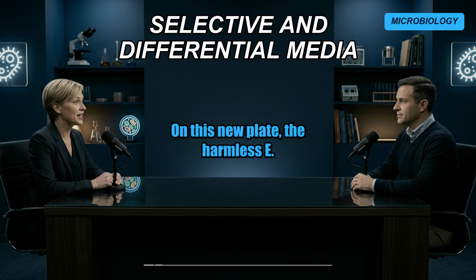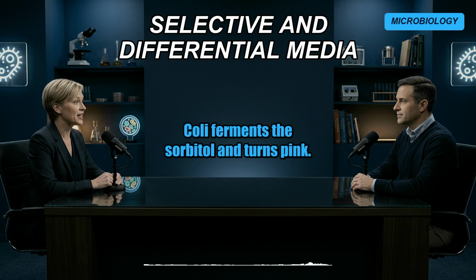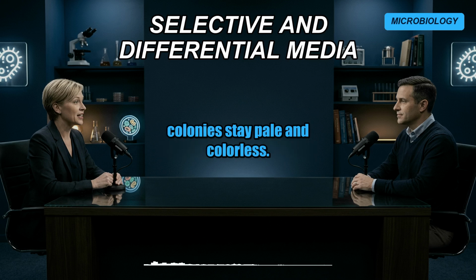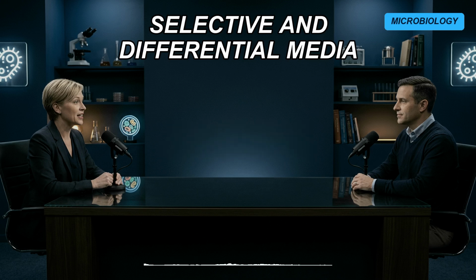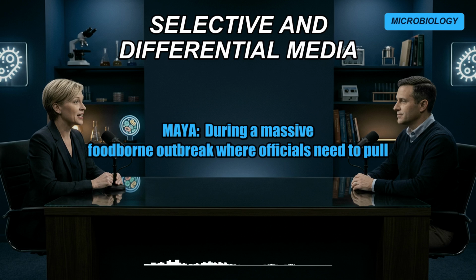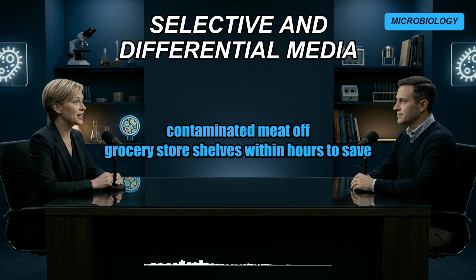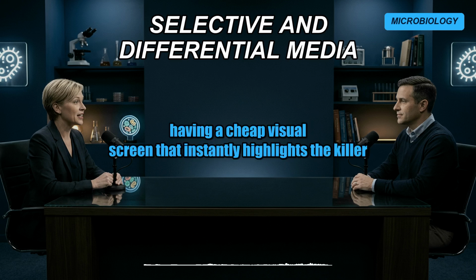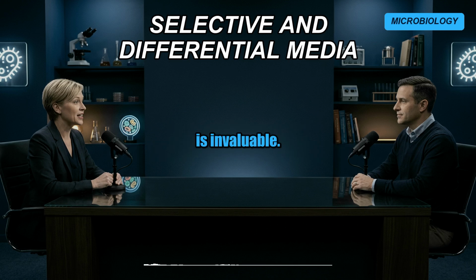On this new plate, the harmless E. coli ferments the sorbitol and turns pink. The deadly O157 strain fails to ferment it, and its colonies stay pale and colorless. That's genius. During a massive foodborne outbreak where officials need to pull contaminated meat off grocery store shelves within hours to save lives, having a cheap visual screen that instantly highlights the killer is invaluable.